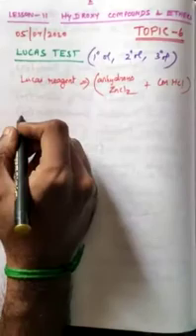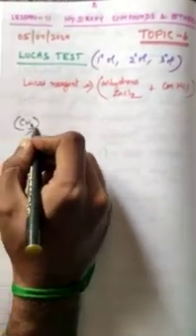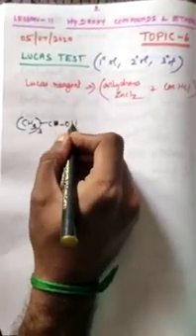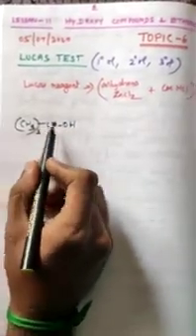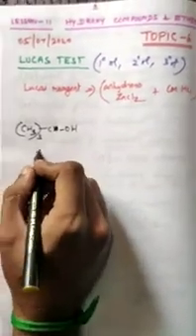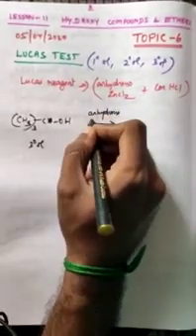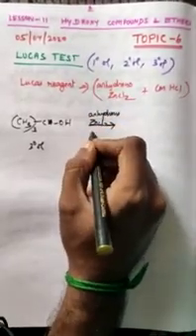Here I am going to take the tertiary alcohol first. We know very well the tertiary alcohol means the alcohol in which the carbon bearing the functional group will not have any hydrogen present in it. So this is called a tertiary alcohol. Here it is treated with anhydrous zinc chloride in presence of concentrated HCl.